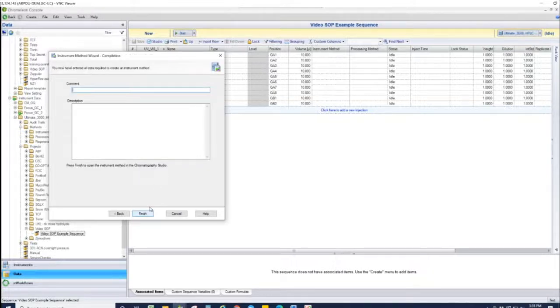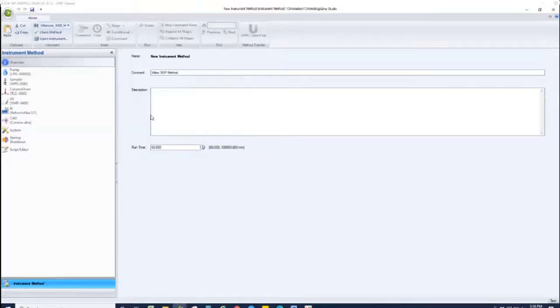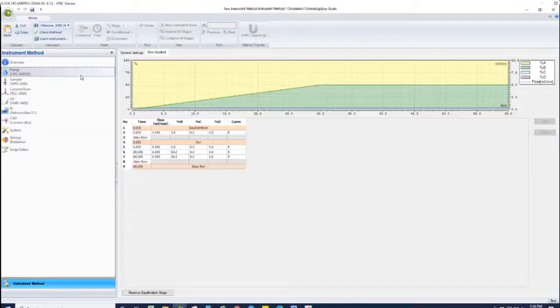Finally, you will need to add a comment and description to your instrument method and select Finish. This method will open in the Chromatography Studio. Review the method and make appropriate changes. Remember to save the method by selecting Save and entering the name of the instrument method.